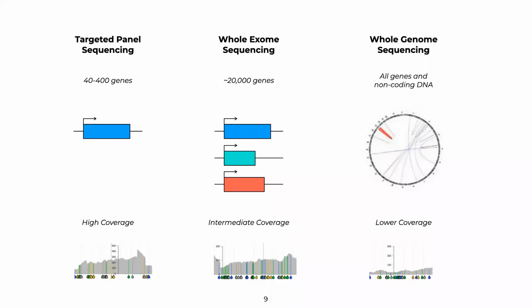But when we talked about this, we also talked about how data could be visualized, and we saw that FASTQ files have individual reads, and by aligning those reads to a reference genome, we can actually start looking at the different mutations that we discussed here and understand how those mutations appear in real data.